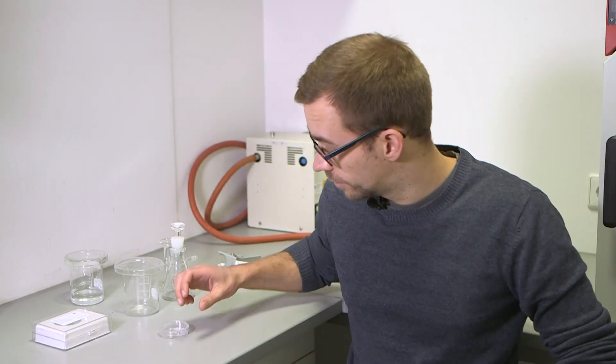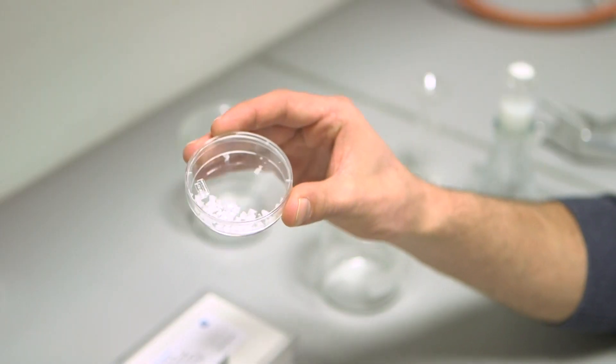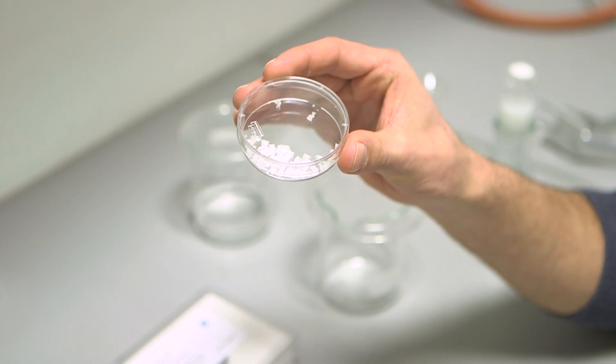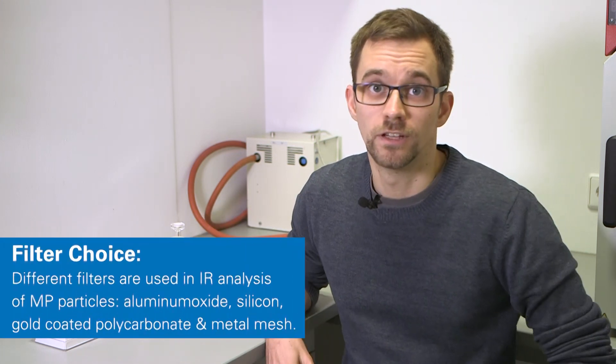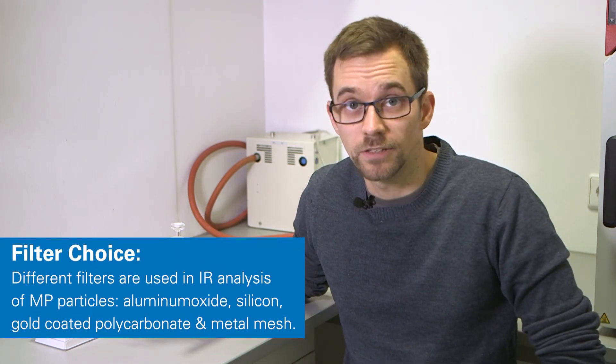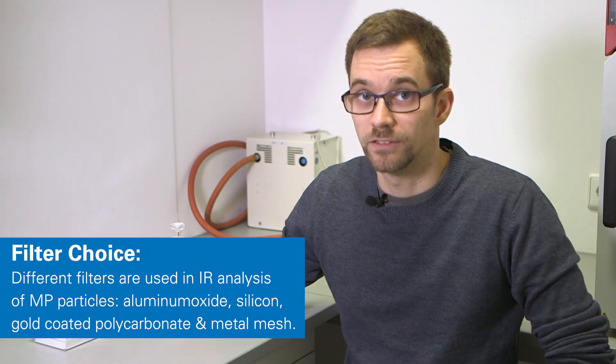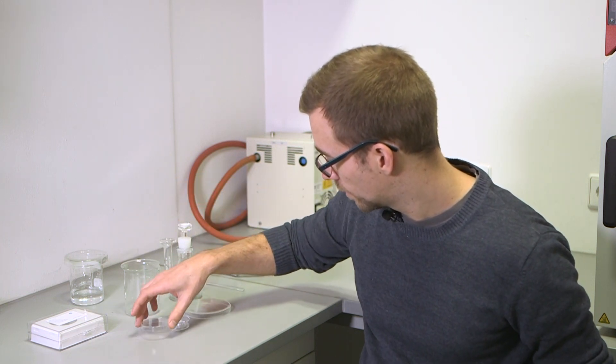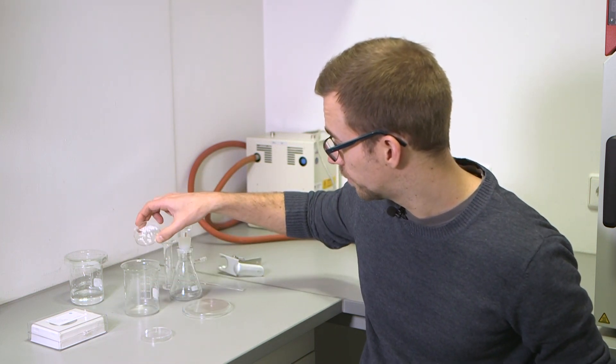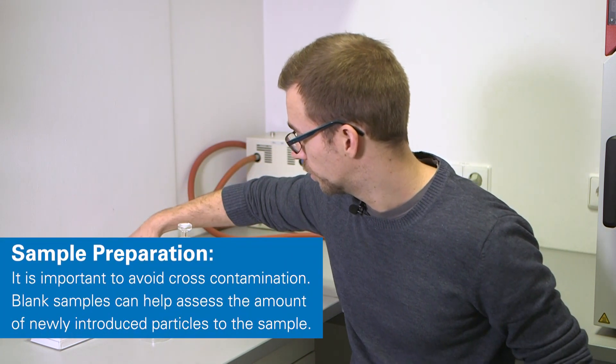We're now in our laboratory and we're going to take care of the sample preparation. So that means we're going to dissolve our sea salt sample in distilled water and then filter it through aluminum oxide filters. There are several different filter types like silicon or gold-coated polycarbonate, but we will be using these. I'm going to pour our salt sample into the beaker and then we'll dissolve it in distilled water.